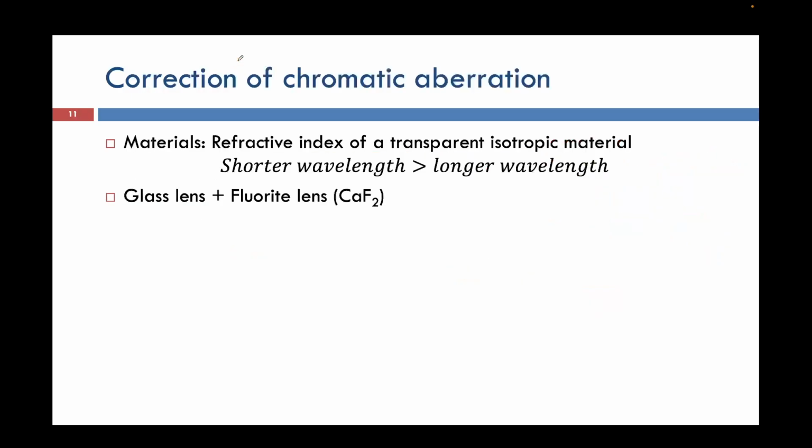Okay. Another thing is that we need to minimize this distortion as much as possible. I have told you earlier how we can correct chromatic aberration. One of the important things in chromatic aberration is how we choose our lens, right? Depending on the lens, we can also rectify the chromatic aberration. Why is the material we choose for the lens important?